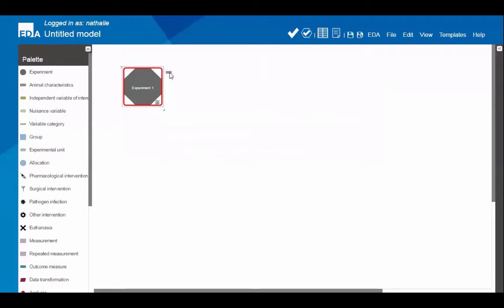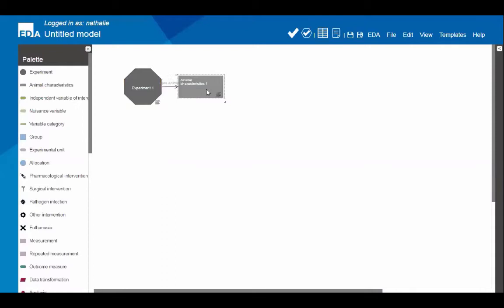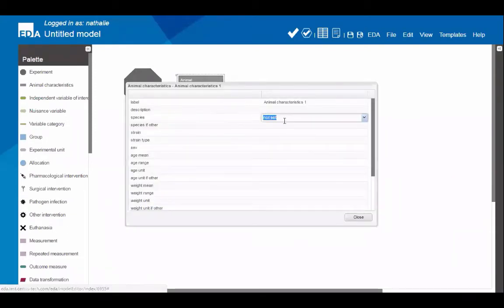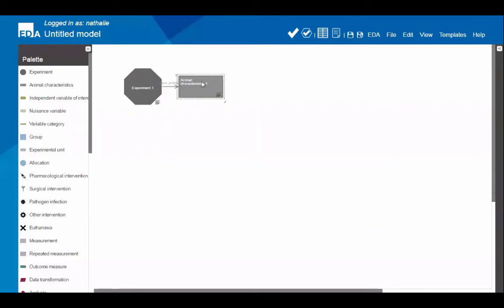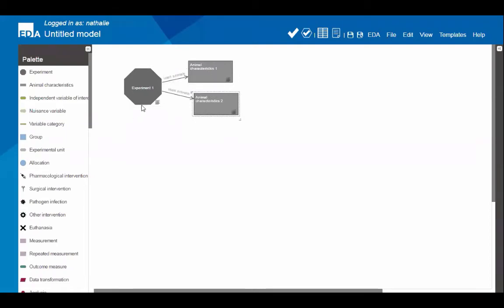With the experiment node selected, hovering to the right shows a little node menu that only displays nodes you can connect to that node. In this case you can connect animal characteristics to the experiment node — clicking on it adds that node and connects it automatically. In the animal characteristics properties you can enter species, strain, sex, age, and so on. If you have different animal characteristics in your experiment — for example, working with male and female rats — you'd add two different nodes, one for each.